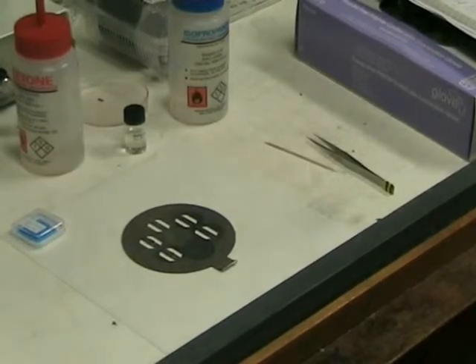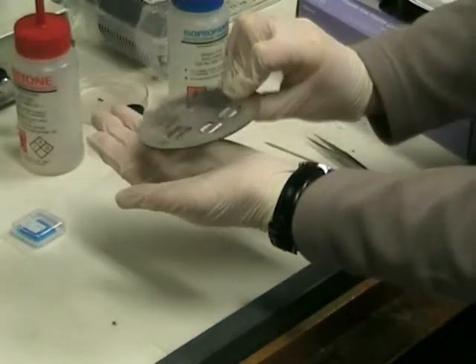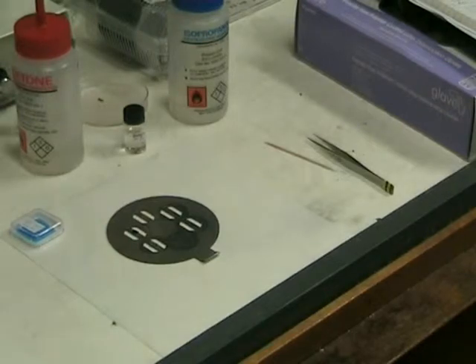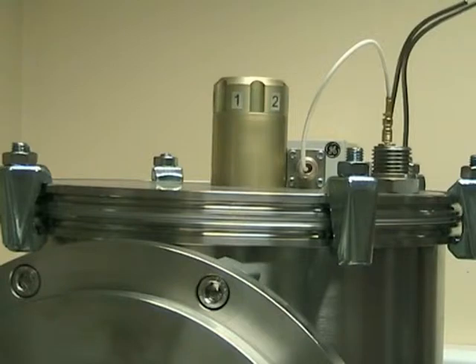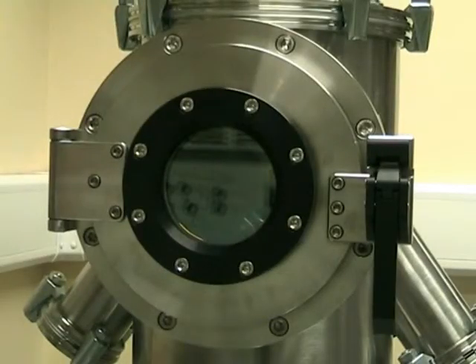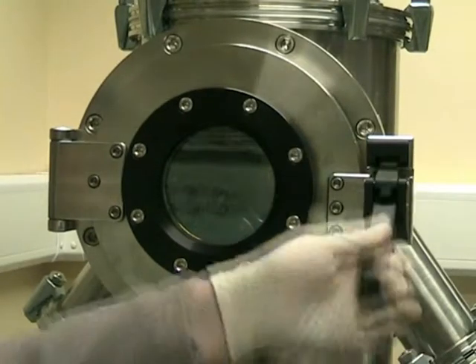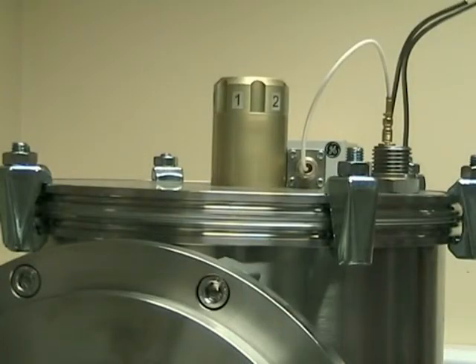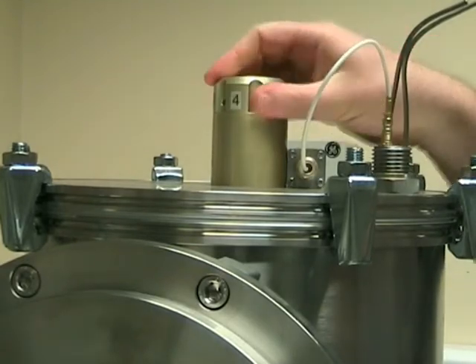Check that the samples are stuck to the holder by turning the holder upside down with your hand underneath. If the samples are not stuck, you will be able to catch them. Check that the sample place number is set to 1. With the samples facing down, put the holder into the evaporator so the handle sticks out of the hole in the 1 position. You might want to practice without the samples on the holder as there is not a lot of room. With some holders, the handle restricts the rotation of the sample position. Check this by rotating the holder through all the positions. Finish on position 1.